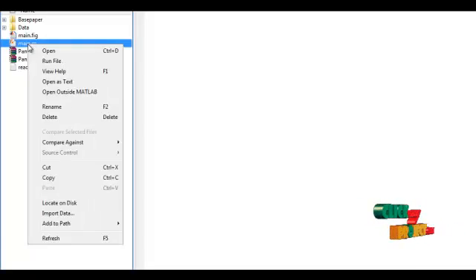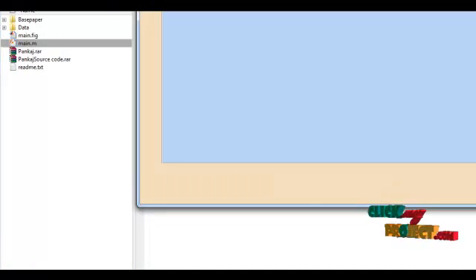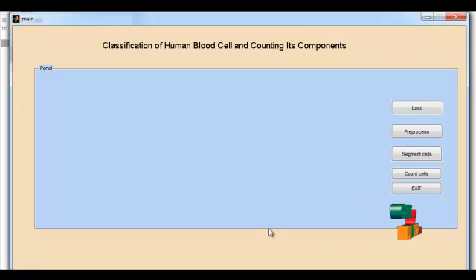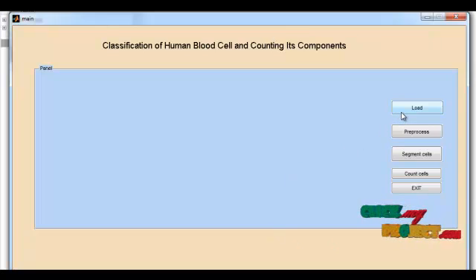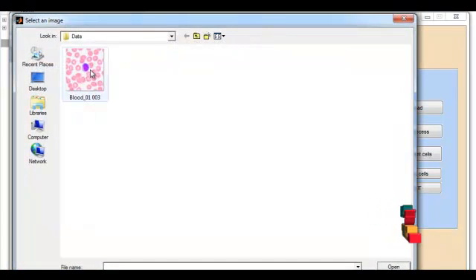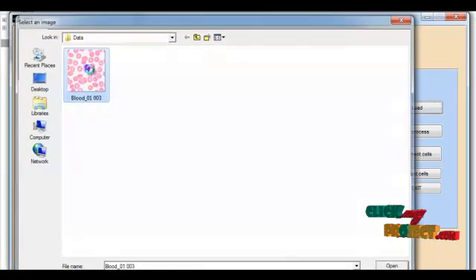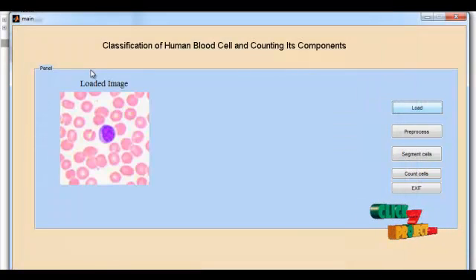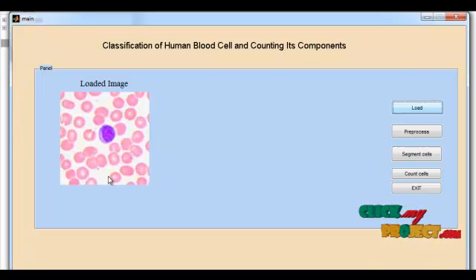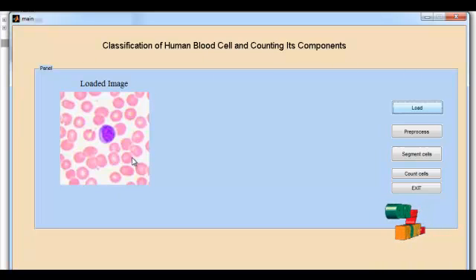Let us discuss the running procedure of the project: segmentation using morphological watershed transformation for counting blood cells. Right-click on the main.m file and press the Run button to show the execution window. Press the Load button to load a blood tissue image. Select any blood tissue — the selected image is displayed in the first axis.